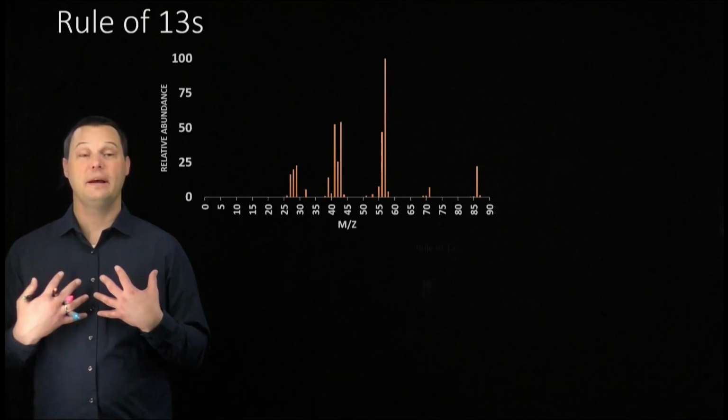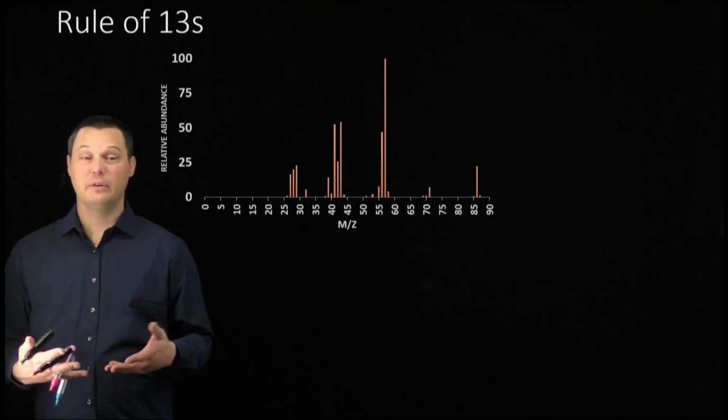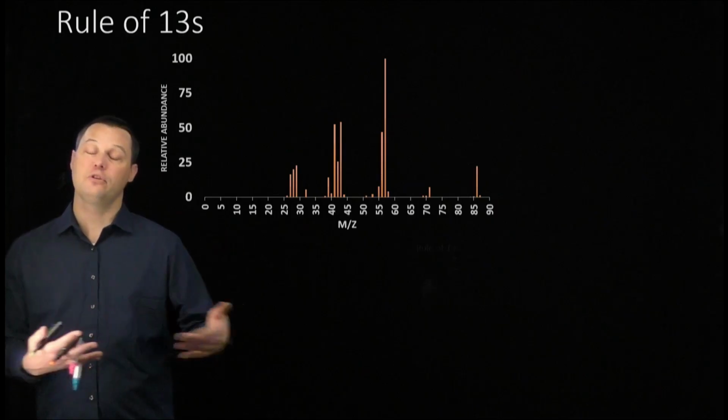Now, when I teach mass spec to my students, I tell them you probably can't solve an entire structure just from a mass spec. And I generally think that's true. In fact, I tell my students you really shouldn't spend more than 30 total seconds analyzing the mass spec before you move on to other spectra.